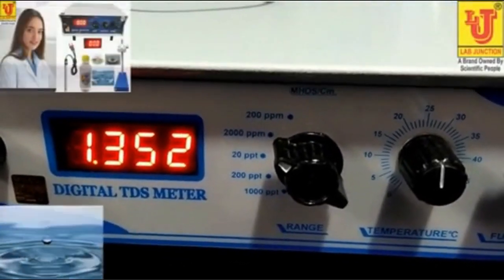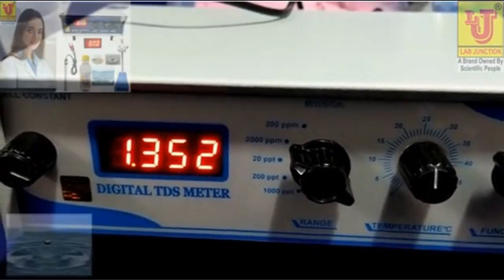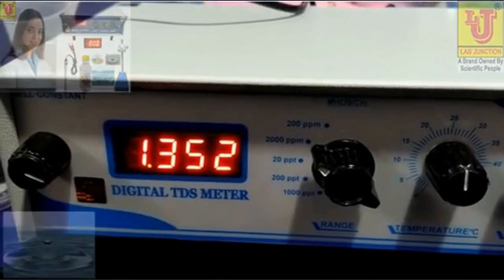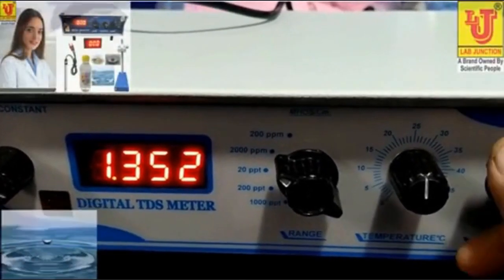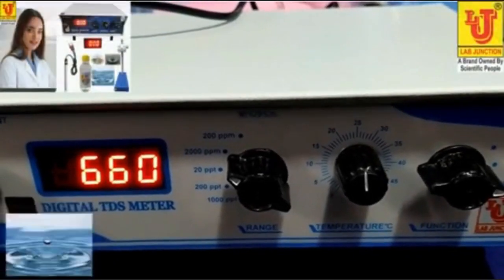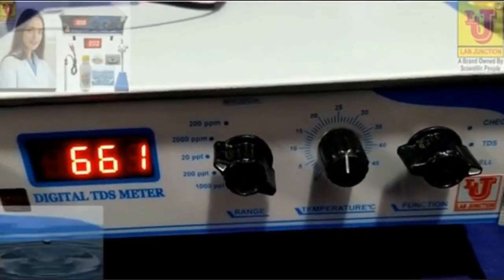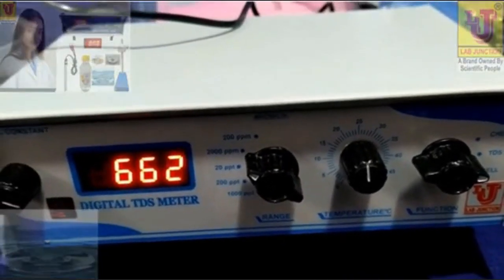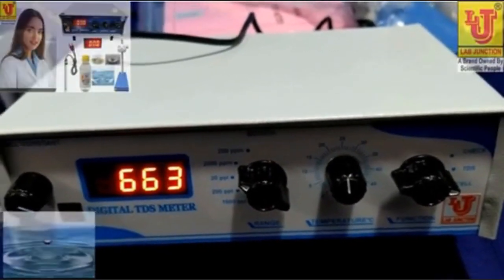Suppose you go on tour for a week. Then some other person uses this digital TDS meter. After 1 week you come and need testing of the digital TDS meter.